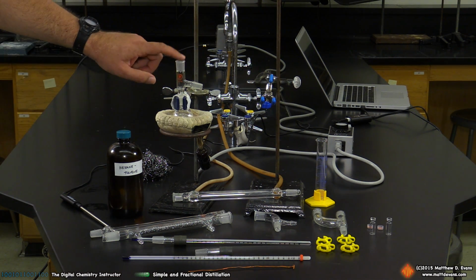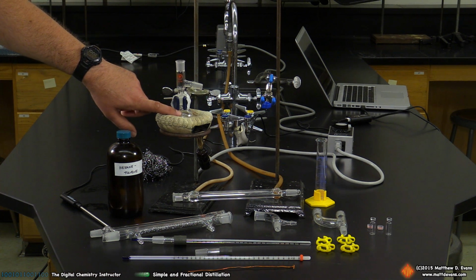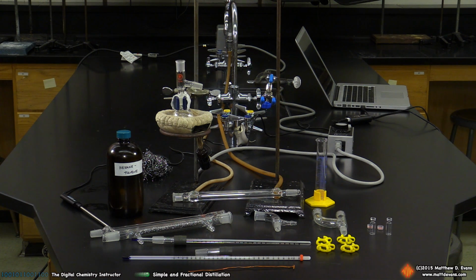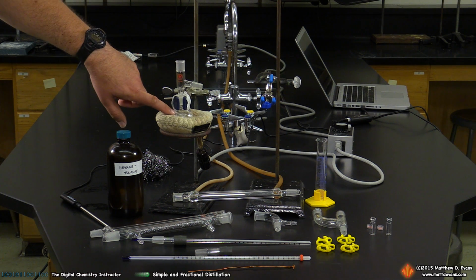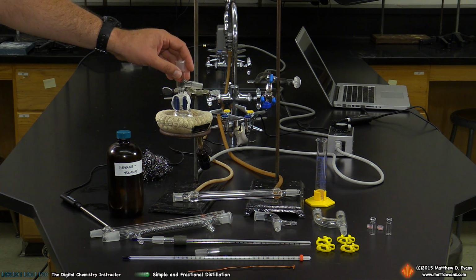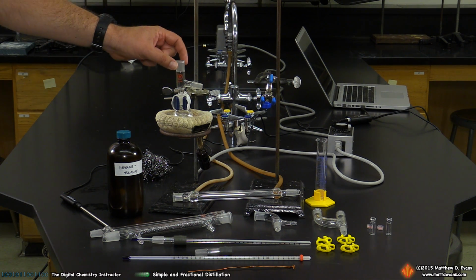But before I move on to the three-way adapter, I almost forgot to mention that there's also a boiling stone added to this round bottom flask, which is critical. Don't forget the boiling stone. It prevents rapid boiling, or violent boiling, I should say, of the mixture. So 50 milliliter size round bottom flask, 28 milliliters of the mixture, boiling stone, don't forget the boiling stone. Three-way adapter for a simple distillation setup. At this point, a condenser is going to go here and a thermometer up top.